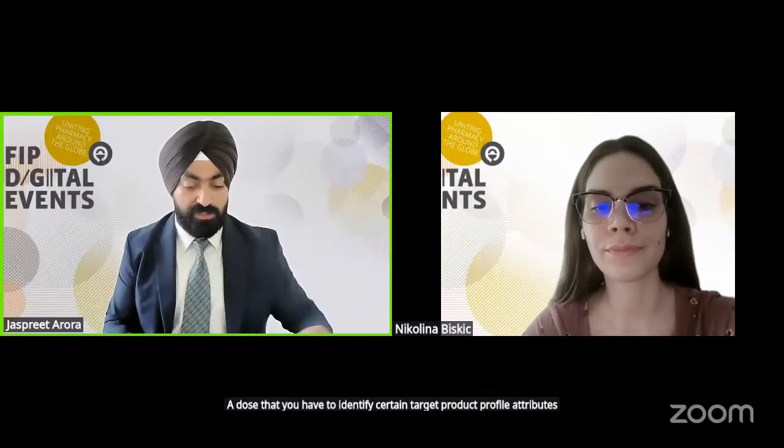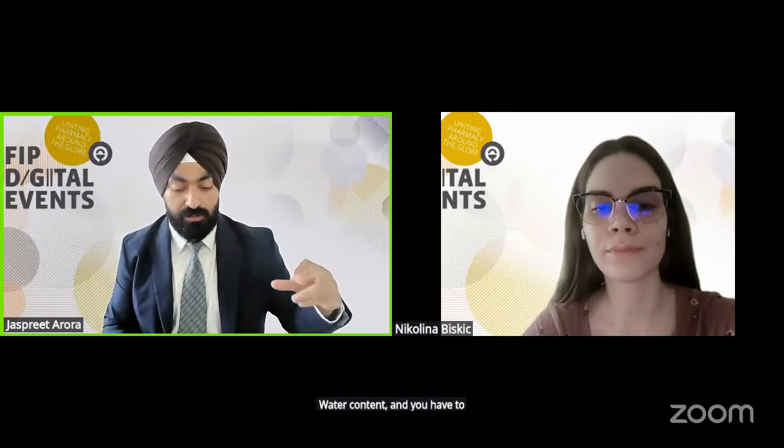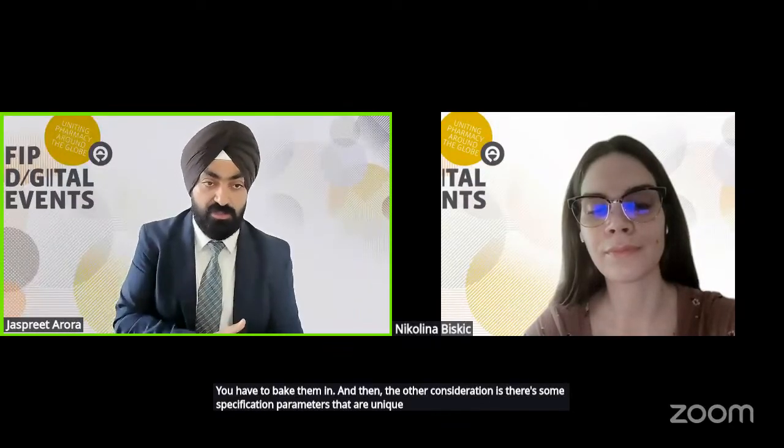You have to identify certain target product profile attributes, whether it's your dissolution rate, your assay, or water content, and you have to be able to show that these are repeatable, concise, precise, and scalable. So these are the same CMC considerations that you have for tablets; you have to bake them in. And then the other consideration is that there are some specification parameters that can be unique to multi-particulates. You have to consider those as well, because you have smaller particles, higher surface area, and a few different considerations.